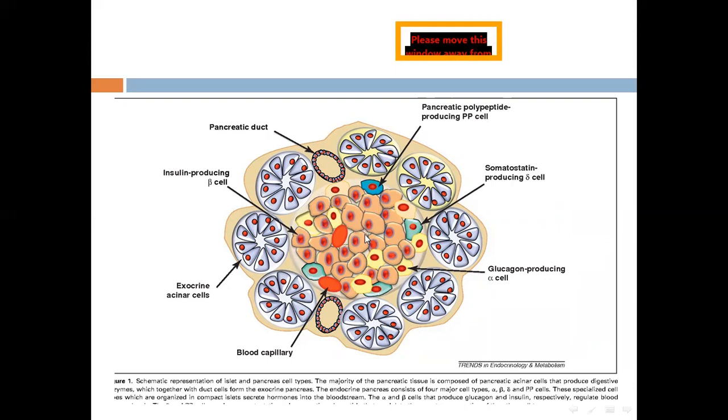This all represents the endocrine part of the pancreas, which is diffused among the acini—the exocrine acini. It is a richly vascularized spherical aggregation of approximately 3,000 cells. Approximately one to two million islets are distributed through the human pancreas, constituting the endocrine pancreas. A somewhat greater number of islets are present in the tail than in the remaining regions.